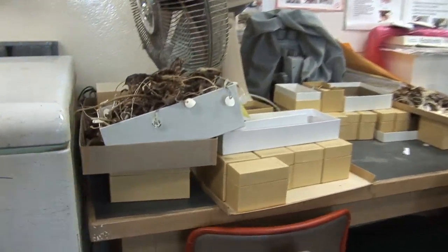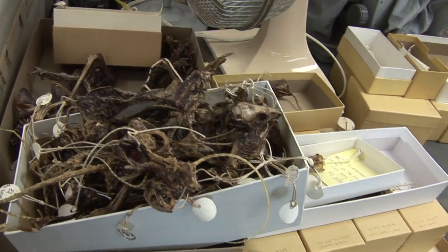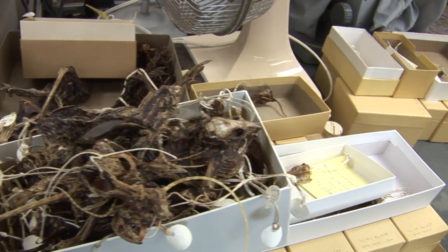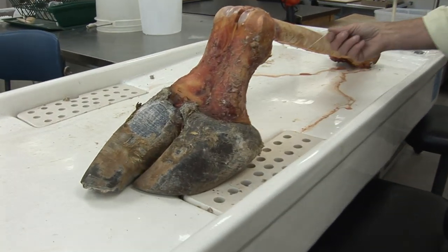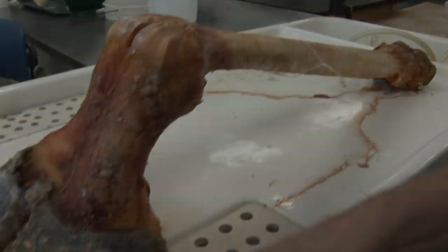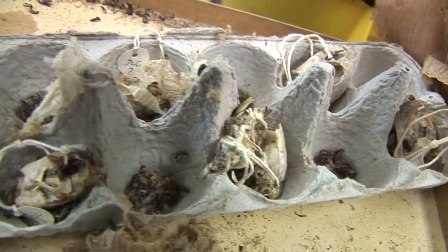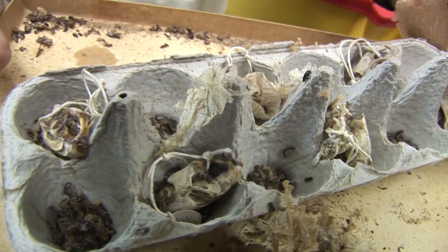A specimen comes in from the field; if prepared in the field, the skeletal material will be dried in the field. If prepared here, it'll be dried here. Sometimes if it's large enough, it'll be soaked in water first to get as much blood out of the bone as possible. Then the specimen is put in with the bugs, and the bugs eat the meat off.